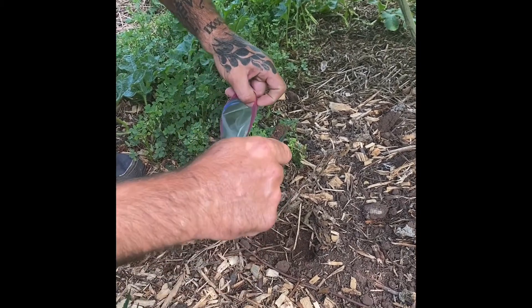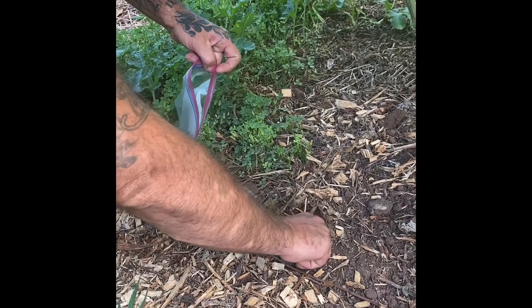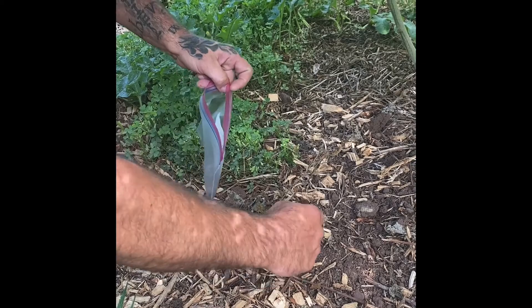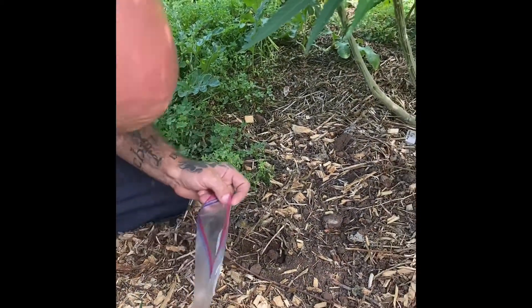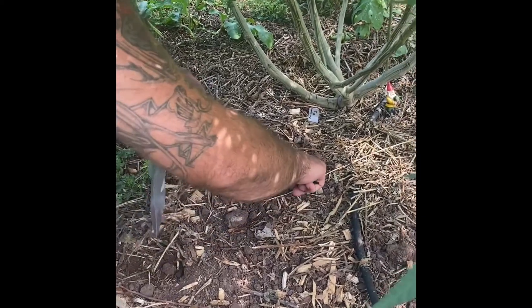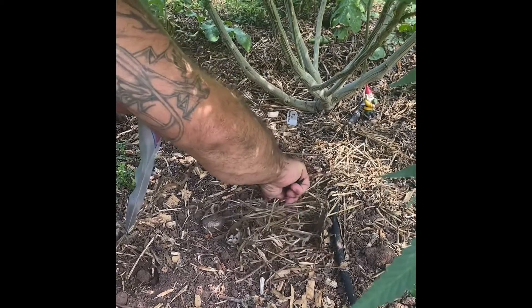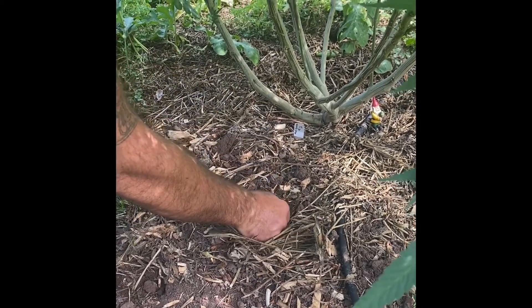Does that look wet enough? This is pretty dry — let me move over here. Yeah, that's much better.